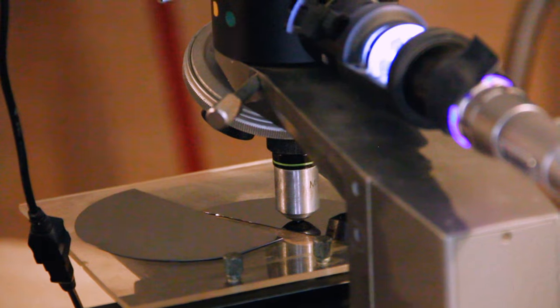We're just now getting the focus right on our microscopes. We're going to be able to take a look at some of the fine features constructed in the nanovap.